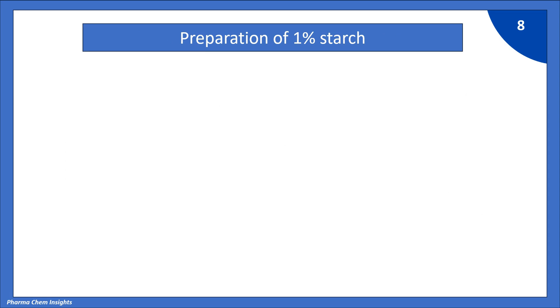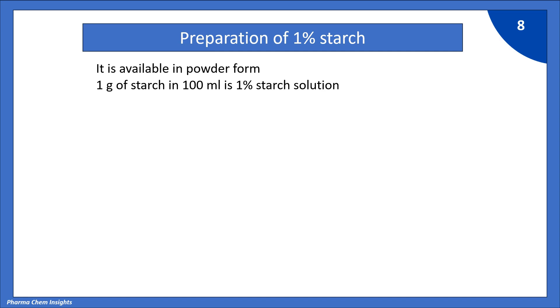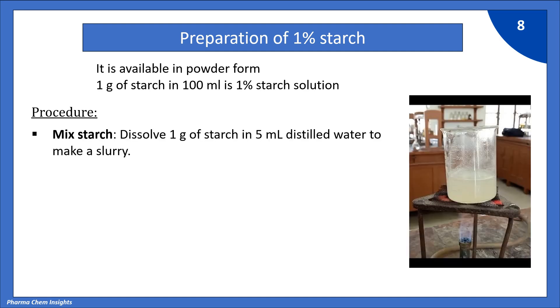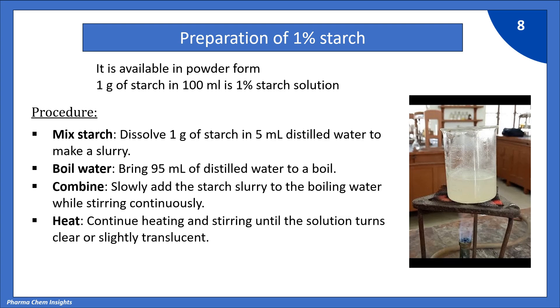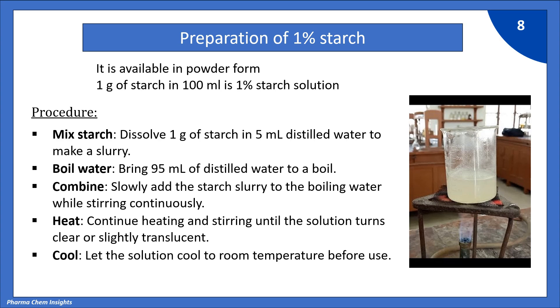We need a 1% starch solution as an indicator. Starch is available in powder form; 1 gram of starch in 100 ml gives a 1% starch solution. To prepare it: dissolve 1 gram of starch in 5 ml distilled water to make a slurry, bring 95 ml of distilled water to a boil, then slowly add the starch slurry while stirring continuously until the solution turns clear or slightly translucent. Let it cool to room temperature before use and store in a cool place.